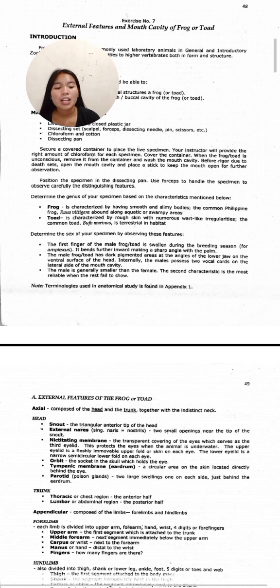The mouth opens into the buccal cavity, which is wide, large, and shallow. It comprises a ciliated columnar epithelial lining, which has mucous glands, and these glands secrete mucus which aids in food lubrication. The frogs do not have salivary glands. That is first the mouth cavity of the frog or toad.